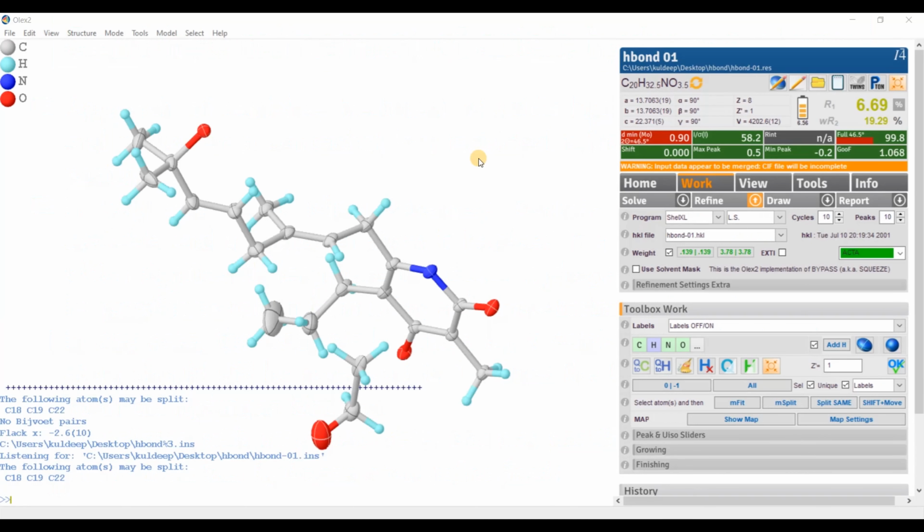This natural compound eromycin crystallizes in the tetragonal space group I4 bar with one molecule of eromycin and one ethanol molecule in the asymmetric unit. At this point, we are going to join the refinement, where all known non-hydrogen atoms are refined anisotropically and all hydrogen atoms bound to carbon have been placed, and the hydrogens on the nitrogen and oxygen are still not placed.